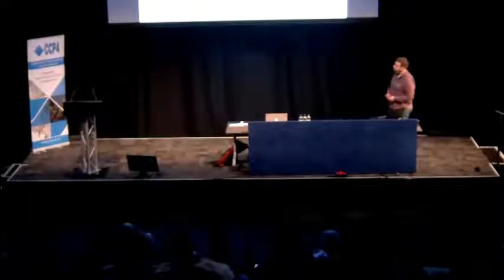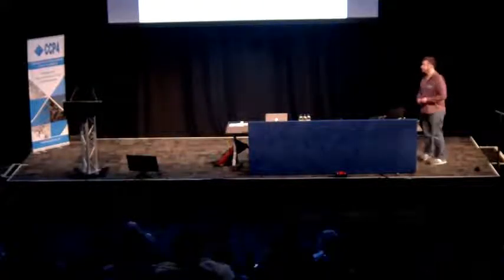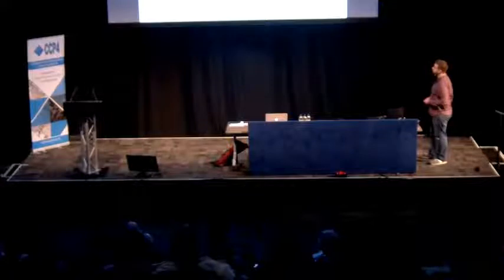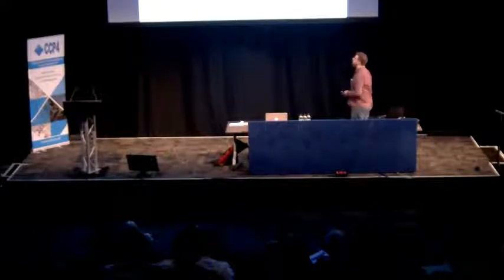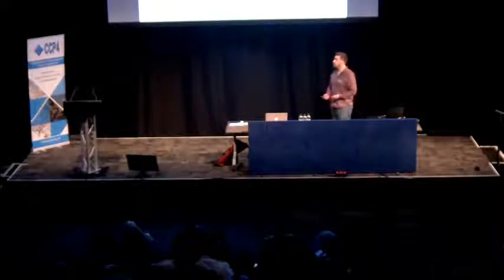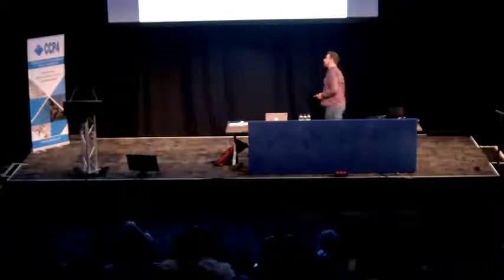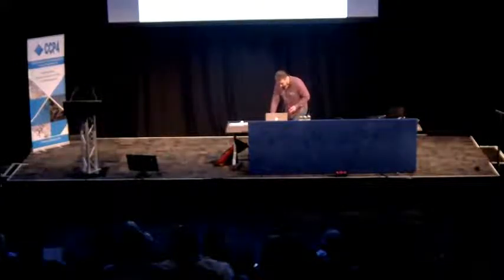LIBG for nucleic acid restraint generation, LORESTR, which is the automatic pipeline for low-resolution refinement, and AceDRG for ligand restraint dictionary and conformer generation. Now, I assume we know what refinement is. We've got a model. We want to refine the parameters of that model so it better fits our data. But in this talk, I'm going to talk about what's new in AceDRG, in the Monomer Library, in Coot, in LORESTR, Refinement with CCP4 and finally some new developments, a new project on B-factor analysis.